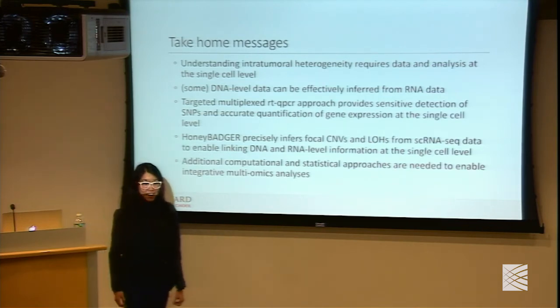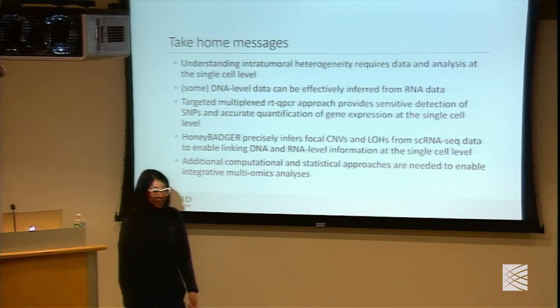Yes? Copy number gains also cause a shifting, but to a lesser extent. Exactly. Have you tried incorporating that into your model? Yes, we have. So exactly as you said, if you have a copy number gain, in theory you could see the allelic imbalance in the gained allele as well. But because allelic imbalance isn't that precise at the single cell level, in order to detect amplifications, it's actually much better to use the expression-based karyotyping, in my opinion.